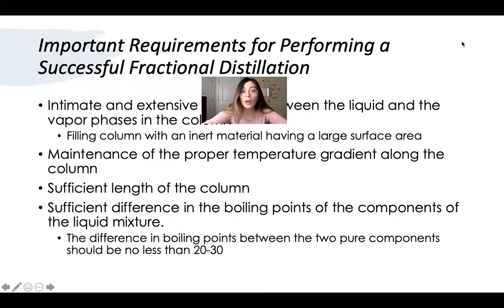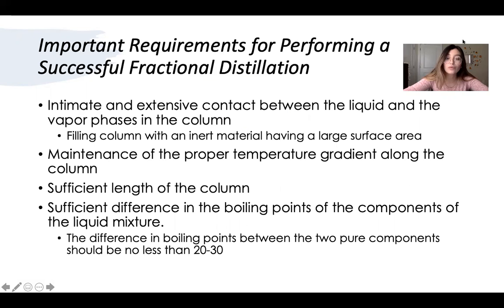Okay, important requirements for performing a successful fractional distillation. This is in your lab manual. I just want to repeat it for you, that way you guys know it. There should be an intimate and extensive contact between the liquid and the vapor phases in the column. Filling the column with inert material having a large surface area will account for the extensive and intimate contact.